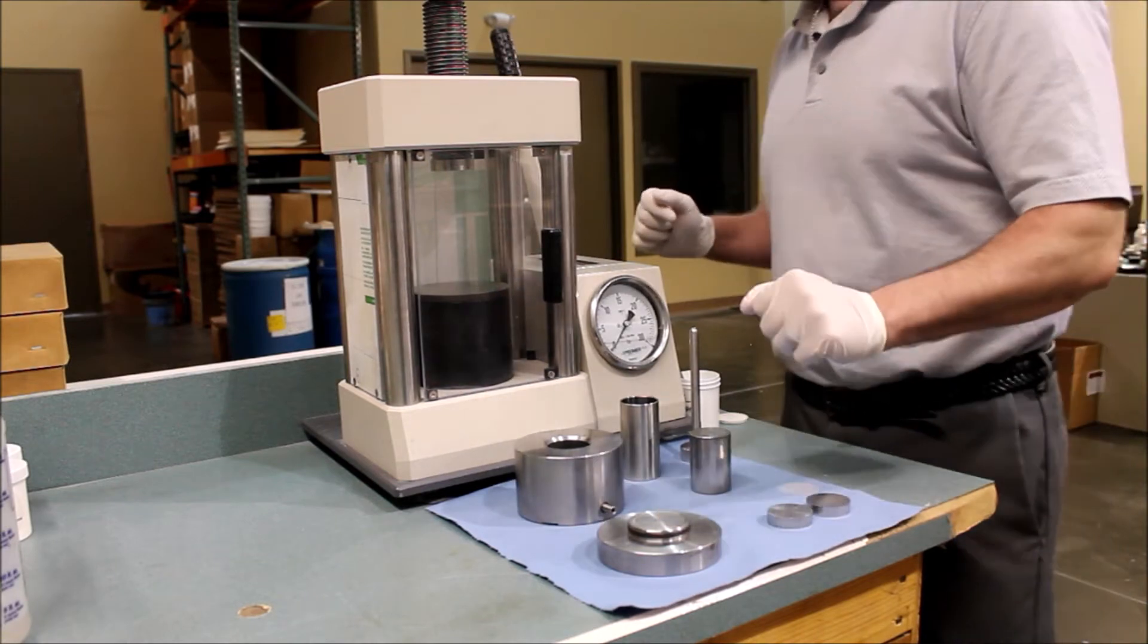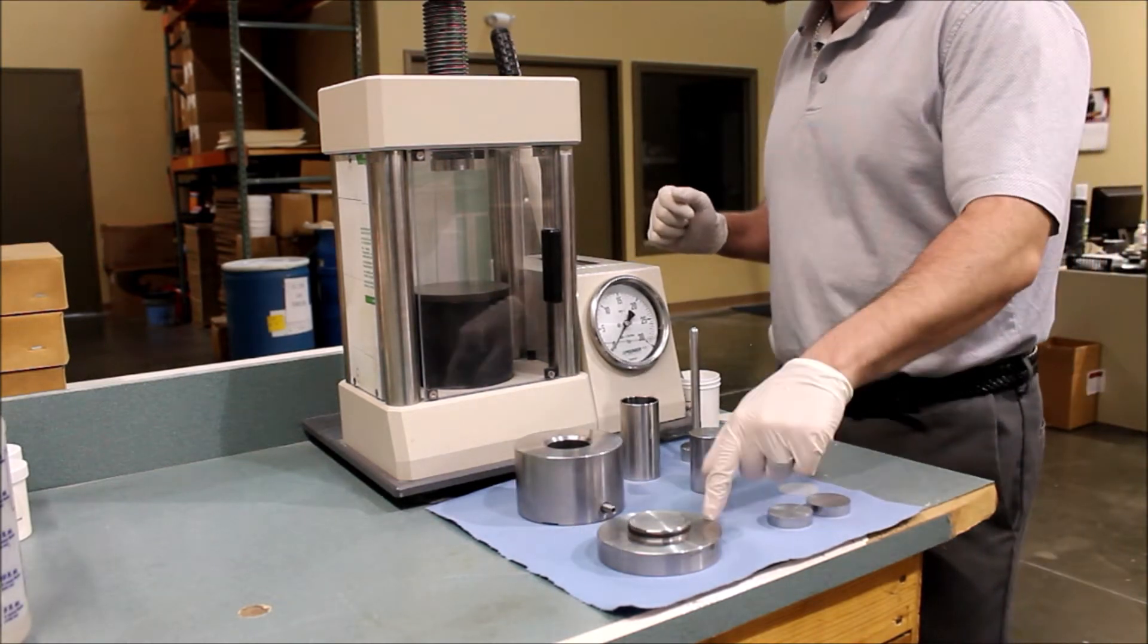Today we will be learning how to make a pellet using a 25-ton manual press and a stainless steel die set.